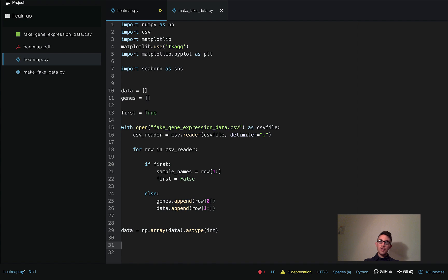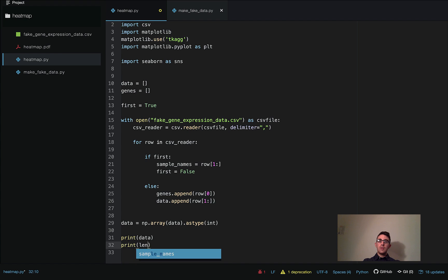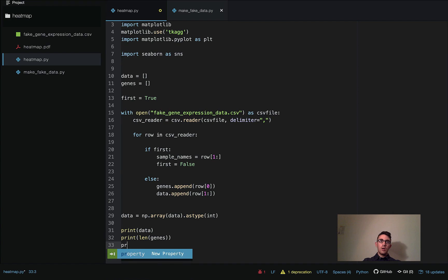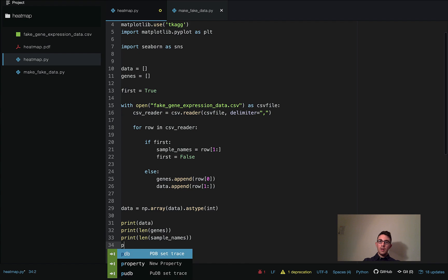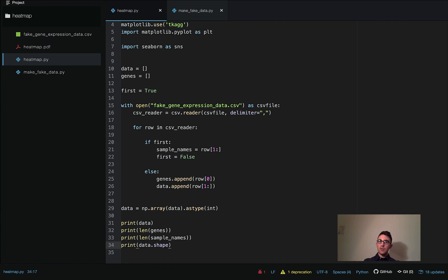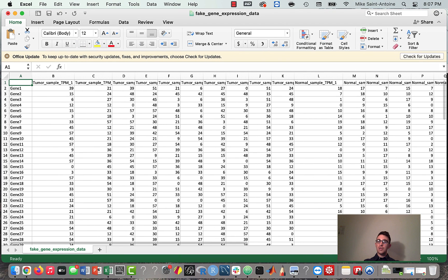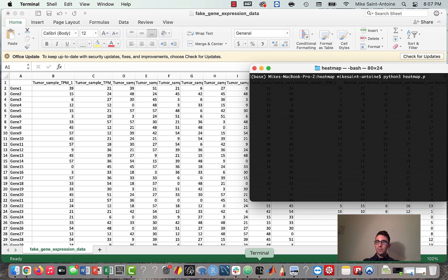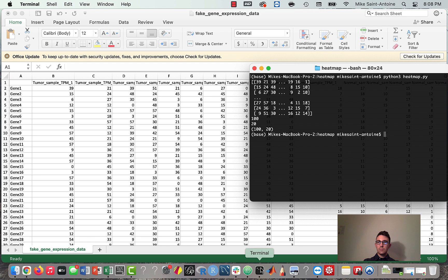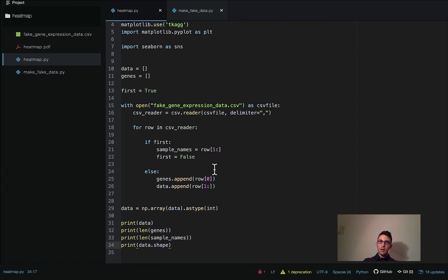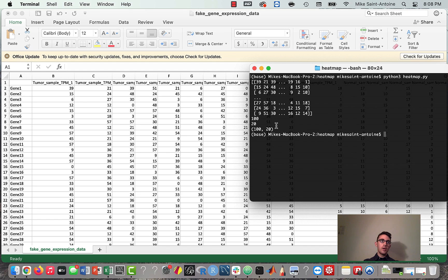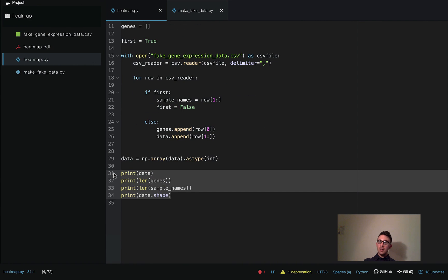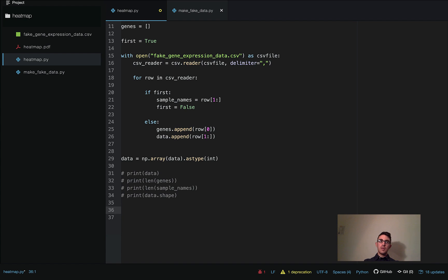Before we actually plot I'm going to do a sanity check — I'll print out `data`, `len(genes)`, `len(sample_names)`, and `data.shape`, just to make sure I didn't screw anything up and that we have the proper dimensions. We can see we had 100 genes, 20 samples, and our data array is 100 rows by 20 columns, which is what we want. So we've got everything read in properly — that's really the hard part. And once we've gotten to this point, the actual heat map plotting is really easy because the Seaborn library has everything built in already.